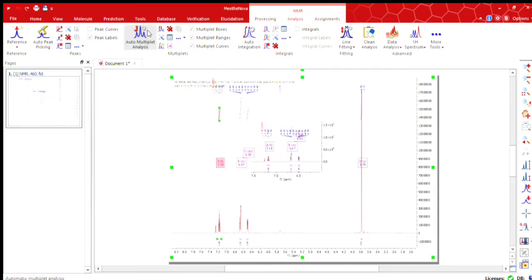Now, to delete this J value and peak fitting value, you can use this delete sign.